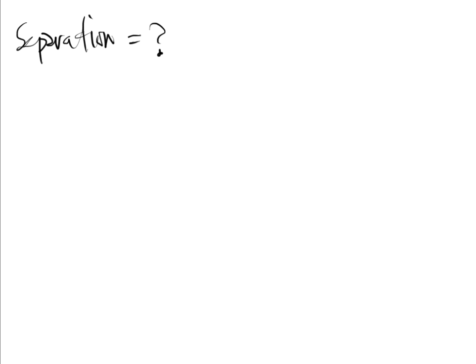Okay, guys, so I've got to be honest with you. Up to this point, we've talked about separation that happens inside of a column. And we just kind of gradually have talked about the separation process and how things separate from each other and they eventually come out of the other end of the column. The problem is that proving separation happens on a sheet of paper is a little more difficult than just talking about it. All right? So, separation is very easy to see with my own eyes if it's colored.